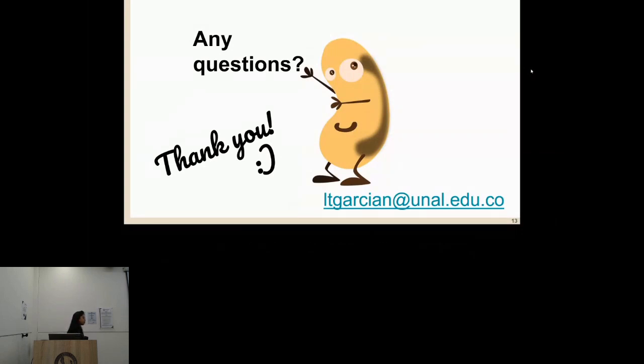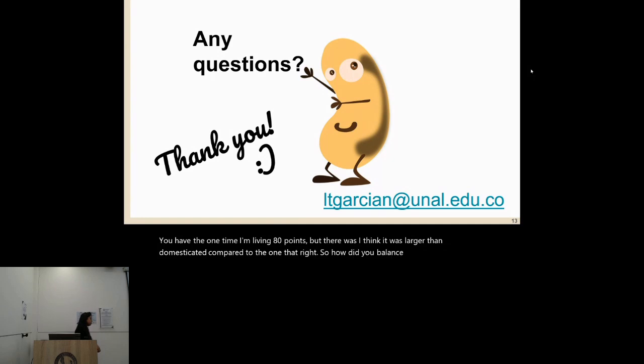Regarding the training data set, you have the wild type and the domesticated ones. But I think the domesticated set was larger compared to the wild type, right? Right. So how did you balance it, or if you didn't, did you think there was an effect on the outcome of your model?